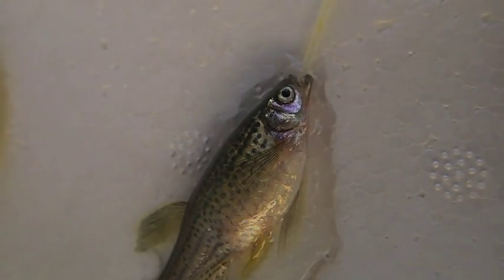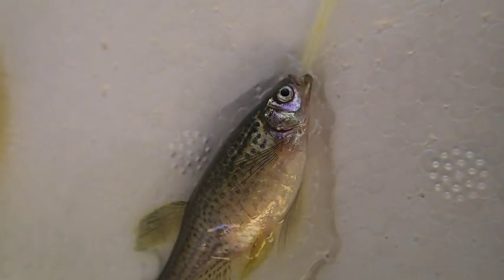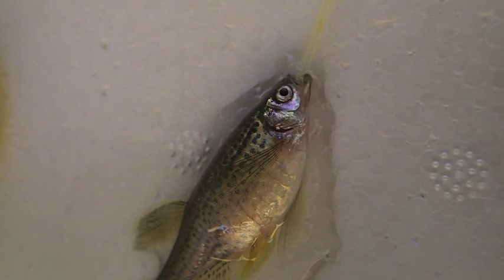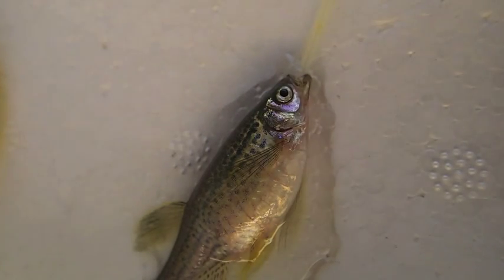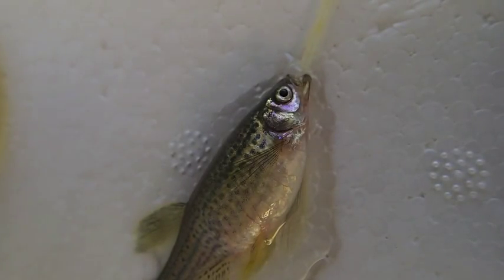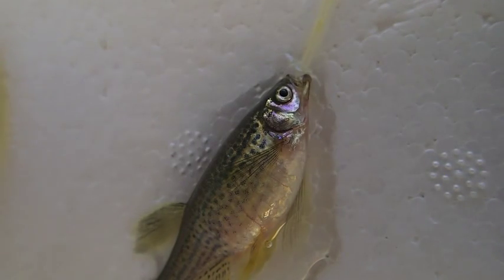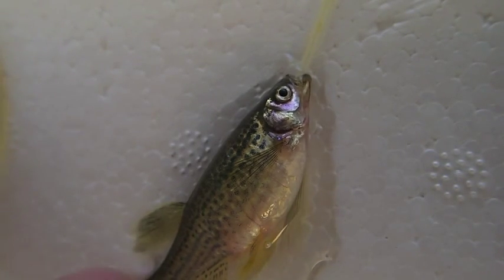Now we've put the fish into recovery mode — we've put the water pump into fresh water that contains no medication. Keep an eye on the opercular movements. You can see they're strong and hard, but sometimes there's a little bit of breath-holding — it goes fast and then it stops. It's very important to maintain water movement past its gills.